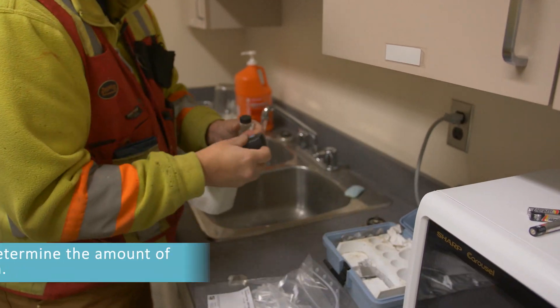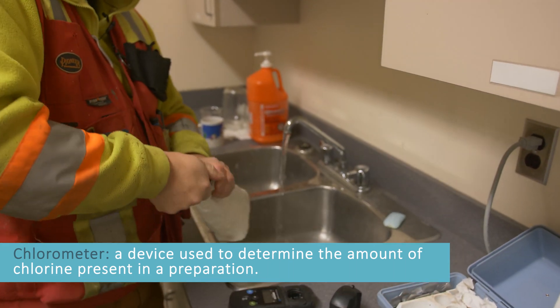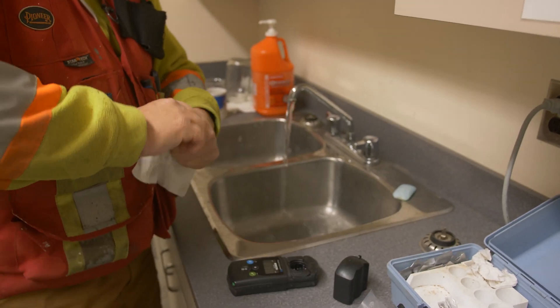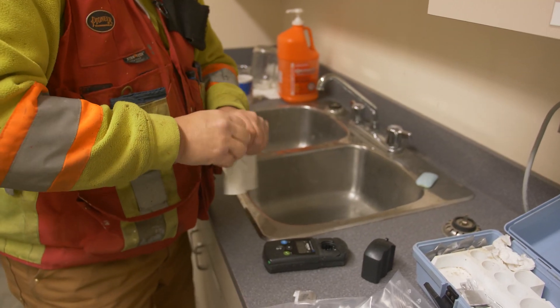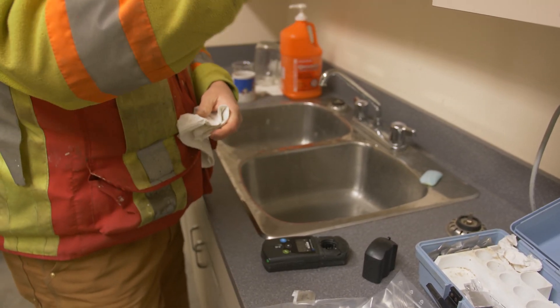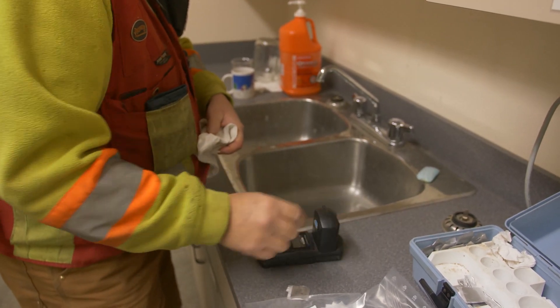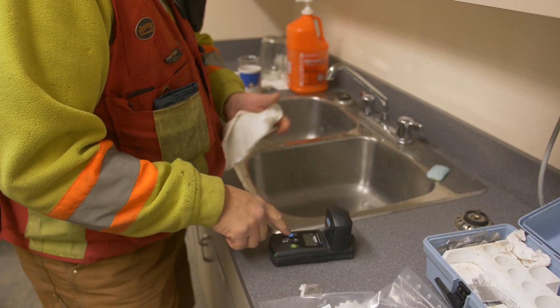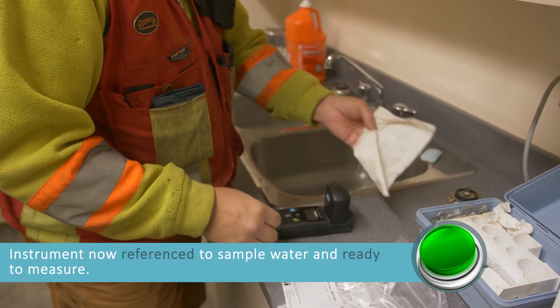Grab the chlorometer and turn it on. Before we do any residual testing we have to zero it out, so we want to get a sample of the blank — just plain old water. Put it inside, push the blue button which is zero. And we're clear, we're ready.